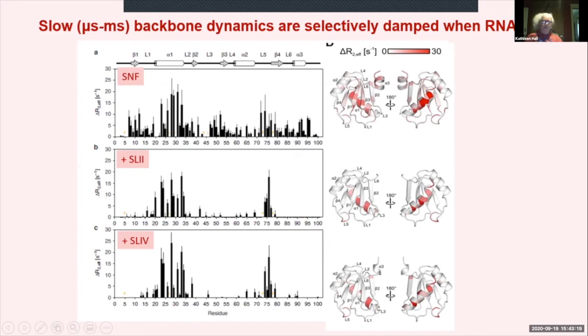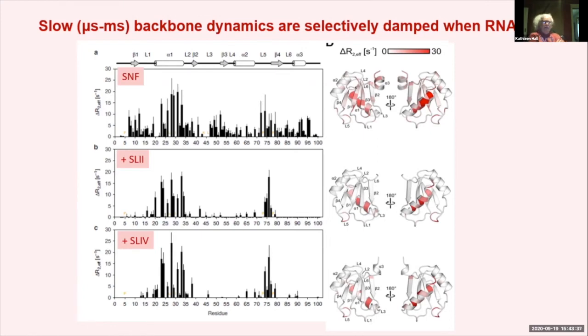The RNA, remember, is sitting on the front side, and the back side, there's no RNA there. So that was sort of peculiar, and it would suggest that even when the RNA is bound, that alpha helix may not be tightly packed in the interface. That interface may not be very well defined.